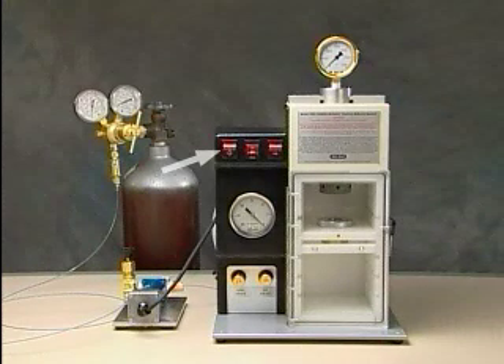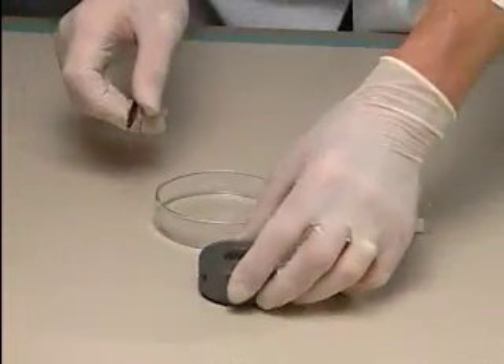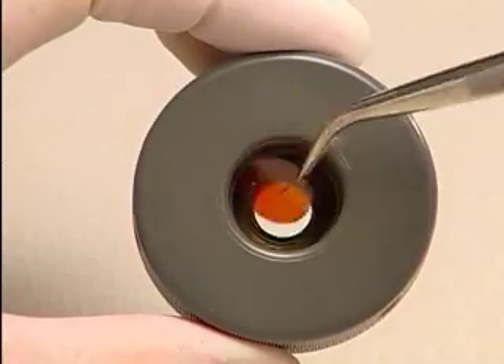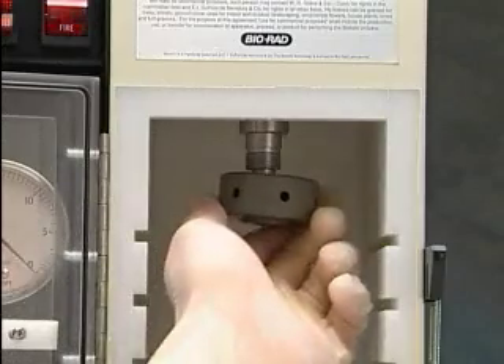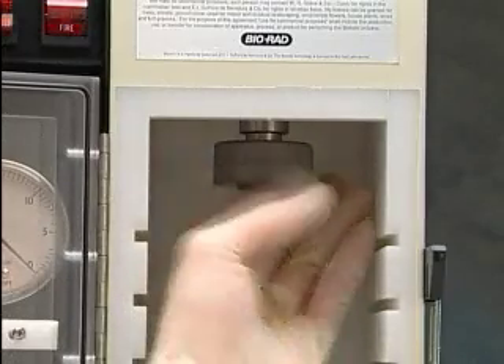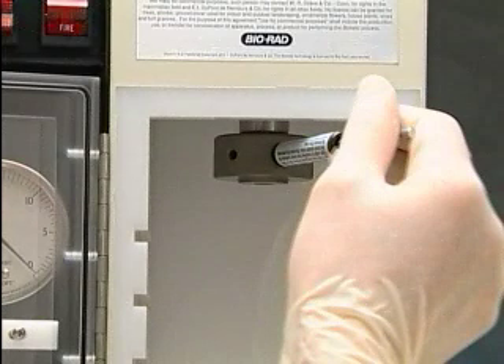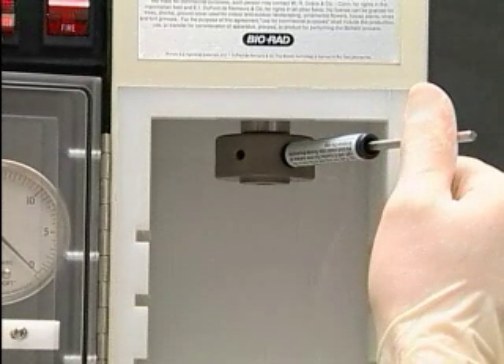Switch on the unit using the on-off switch on the control panel. Select a rupture disc of the desired burst pressure using sterile forceps. Briefly wet the rupture disc in isopropanol and place it in the recess of the sterile rupture disc retaining cap. Screw the retaining cap onto the end of the gas acceleration tube and tighten it with the torque wrench. To use the torque wrench, insert the short end of the metal rod into an accessible hole in the retaining cap, then push the long end of the rod to the right until the stainless steel rod touches the inner surface of the black tube.